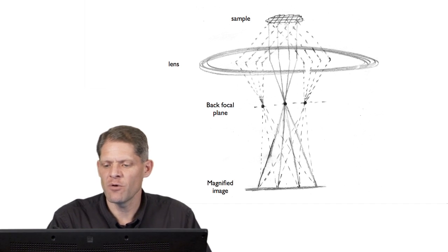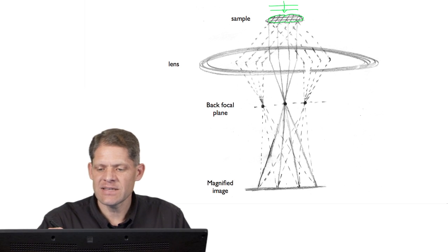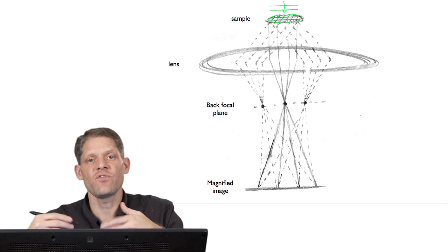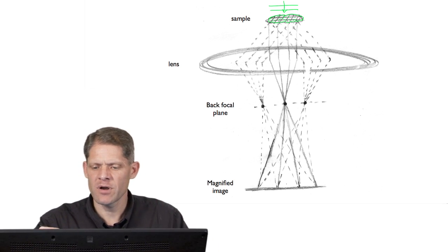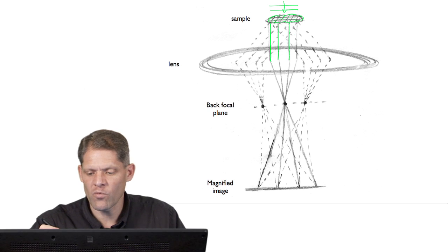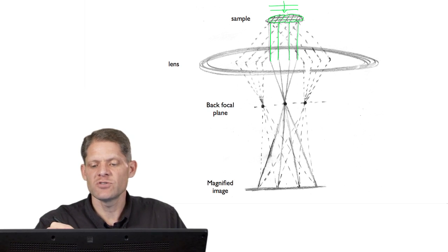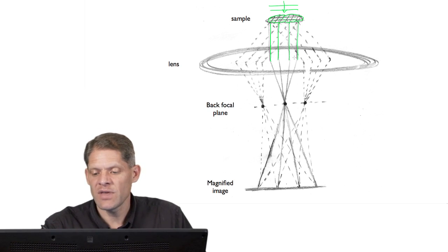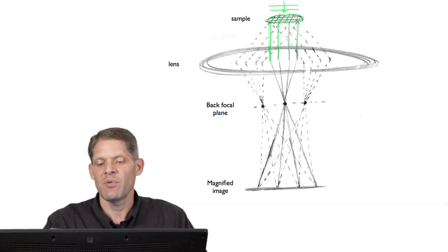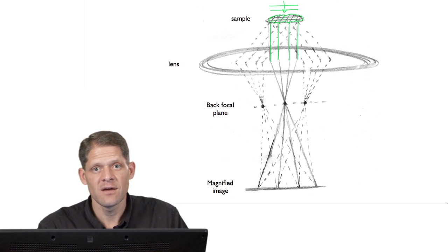In an electron microscope, here's our sample, and there are incident electron waves coming down, hitting that sample. And as it hits the sample, there's millions of scattering centers that introduce phase ripples, and as they propagate forward, you see a constructive interference in wave fronts that could be represented by these waves, and they're produced all over the sample. And remember, the action of a lens is to take parallel illumination and focus it to a particular point on the focal plane of that lens.